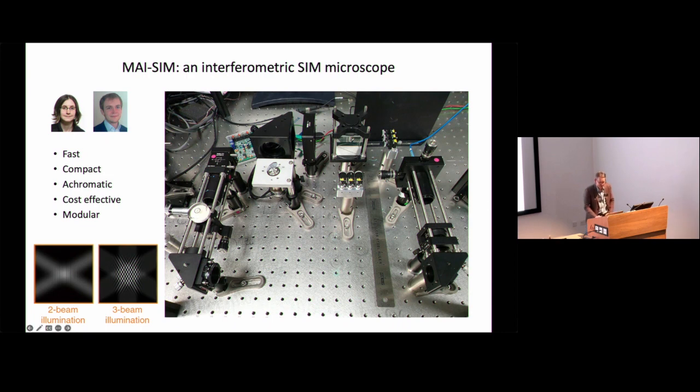And in fact, if you look carefully, you see 3 sets of mirror pairs. So this mirror here corresponds to a mirror here, that middle mirror to the middle mirror here, and that one there. And so what this does is each of these mirror pairs are adjusted in such a way that we can rotate the patterns.